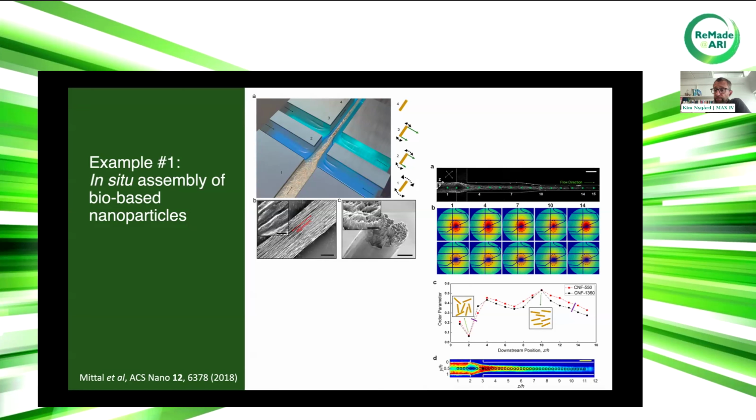And then with this kind of data, they can tune the flow and addition of ions and so on to cause assembly of the particles into fibers. Now these are still fairly sparse measurements, but today with the intensity of the X-ray beams and fast stages, one can really map out the ordering of nanoparticles in such microfluidic channels.